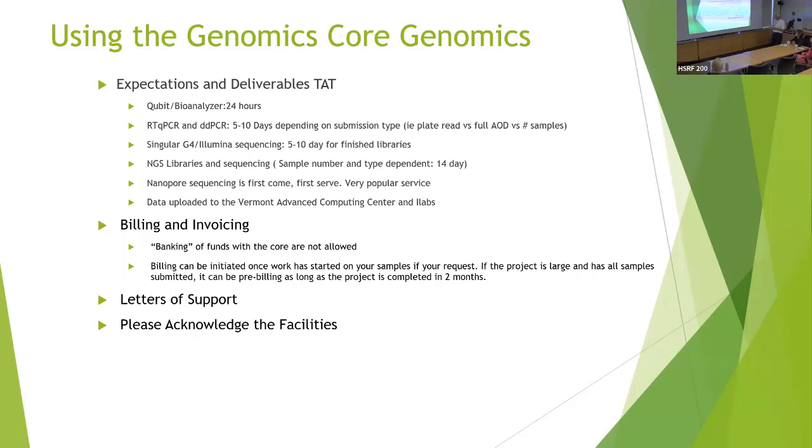Bioanalyzer, we usually turn those samples around in 24 hours. RT-qPCR and digital PCR is 5 to 10 business days. The SingularG4 next-gen sequencer, or Illumina sequencing, as we'll call it, is 5 to 10 days, but it really depends on how many samples you come to us with. 45 samples for RNA sequencing and library builds, it's not going to be 5 days. It's going to take some time to build libraries. I'm sure you would respect that.